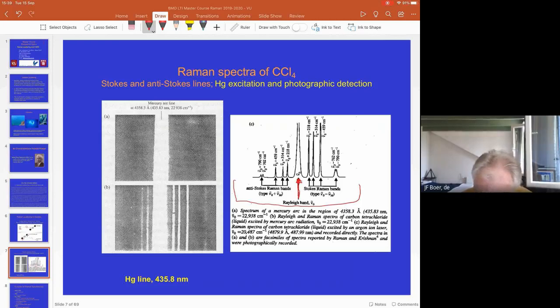But if you look closely at the surrounding of this central peak, we see other wavelengths. Oh, Dirk just confirmed that he discussed Rayleigh scattering. That's great. We see other peaks, and I'm making these arrows red now, these 3 arrows, and these are peaks at a longer wavelength. And we see here a shift of the incident light to wavelengths of a lower frequency. And then also here a 4th wavelength. That's actually 2 tiny little bands.